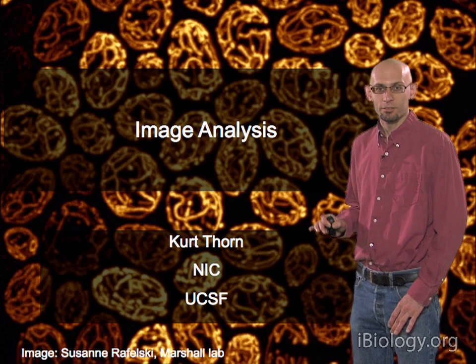And so here's an example from a paper of just trying to segment the DNA in this mitotic spindle, and there's what the DNA image looks like. And here's what Otsu's method detects for the appropriate threshold. And this works pretty well. There are many other algorithms. I think the ImageJ threshold tool has something like 15 or 20 threshold algorithms. Some work better on some kinds of images than others, basically because of the assumptions that are built into them.